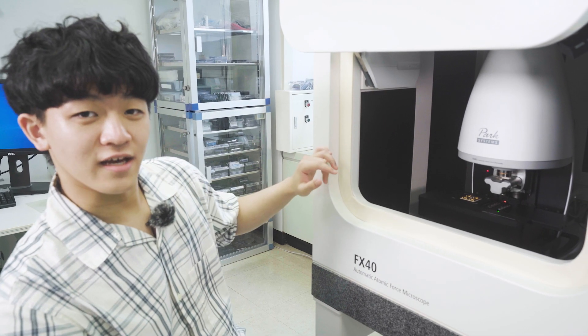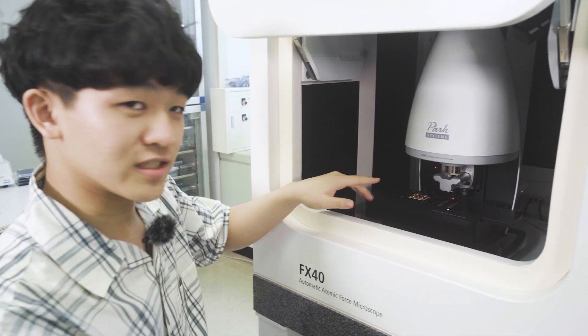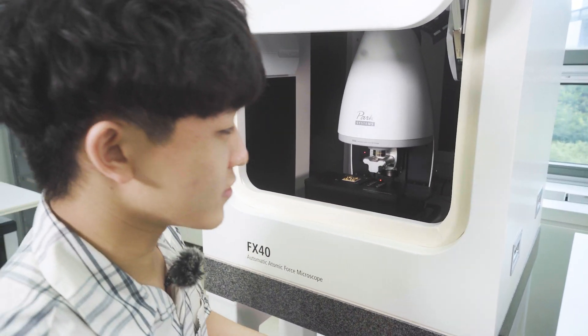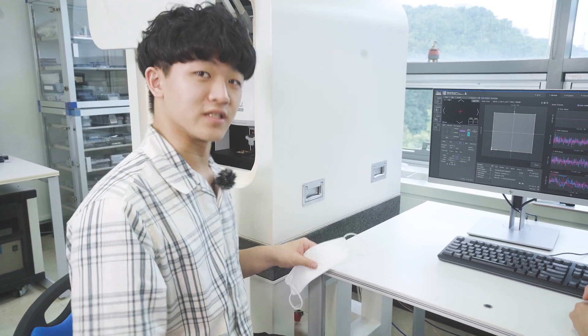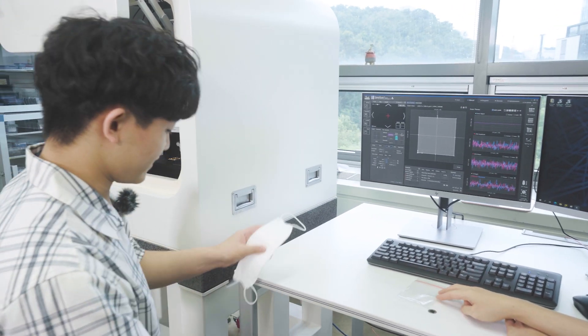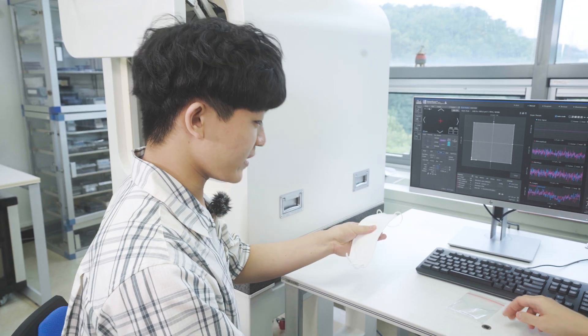This is the FX40 up close and I just learned about the parts and the scanning process. We're about to put a real sample up here and I'm excited to see how the actual scanning process goes. We have our two samples ready: one is the dog fur I procured from my house, from my lovely pets, and here we have a normal KF94 mask ready to be cut.